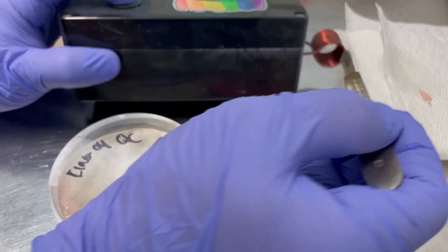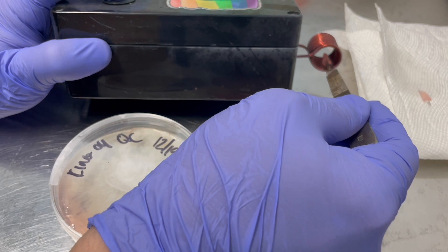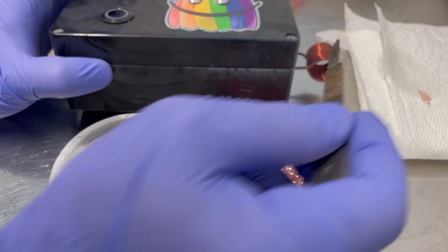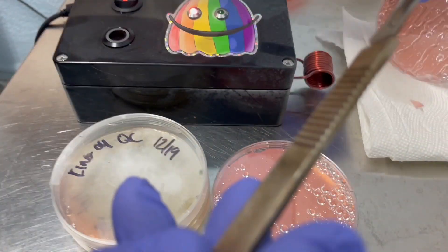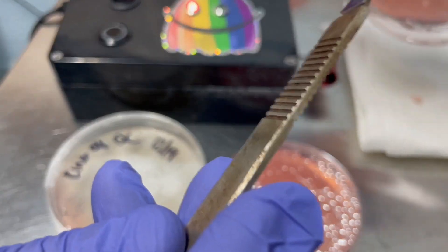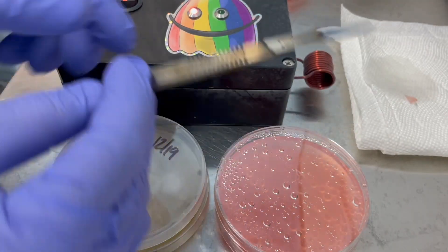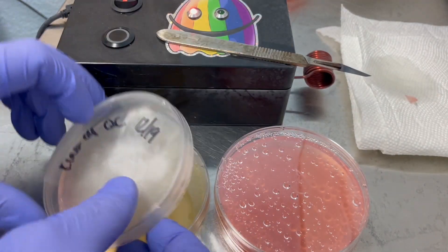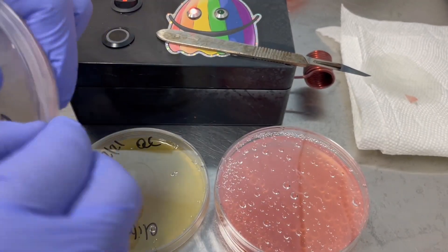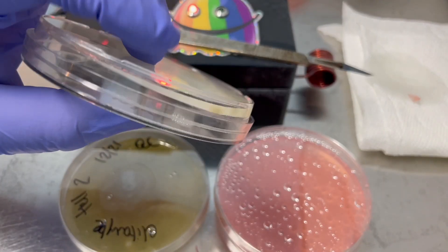Now I'm going to sterilize this again because I don't want to transfer any lion's mane mycelium onto that next plate. Once again, I got some condensation, so I'll just go ahead and tap that out. And this is my king oyster with cracked petri dish, which I shouldn't have used.